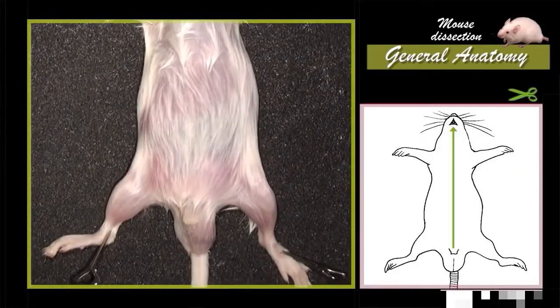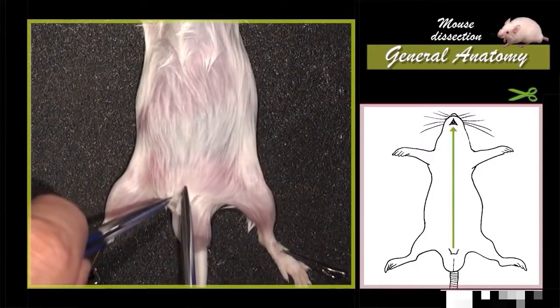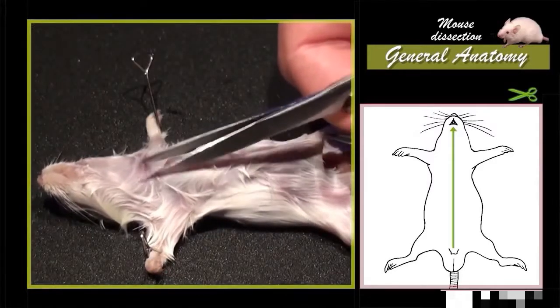It's necessary to locate the prepuce orifice in the male and the urinary orifice in the female. Make an incision in the skin with fine scissors about a couple of millimetres above the orifice. From this opening, the incision must continue on the mid-ventral side up to the chin.